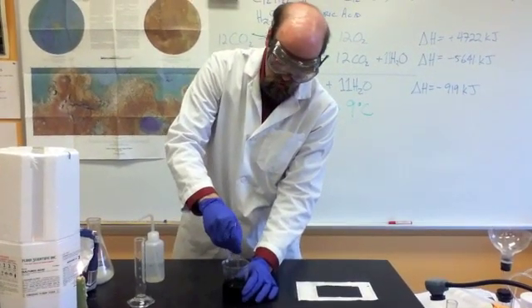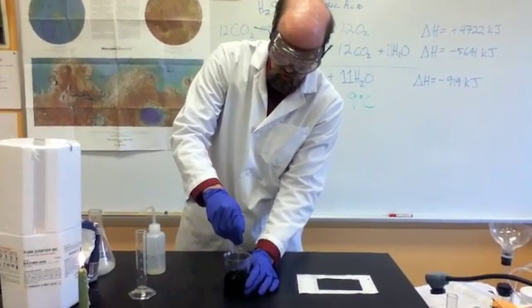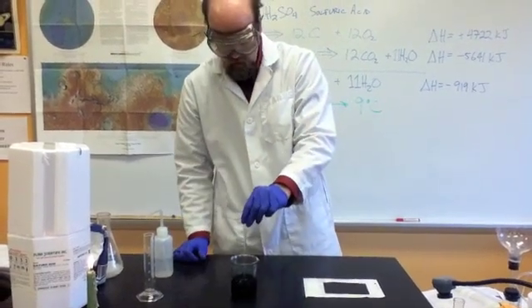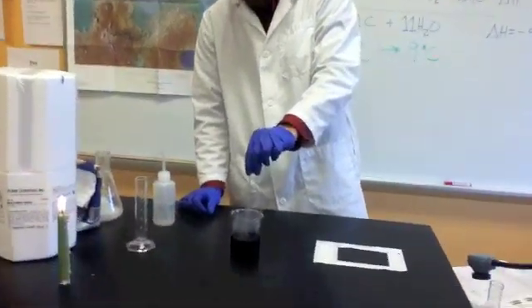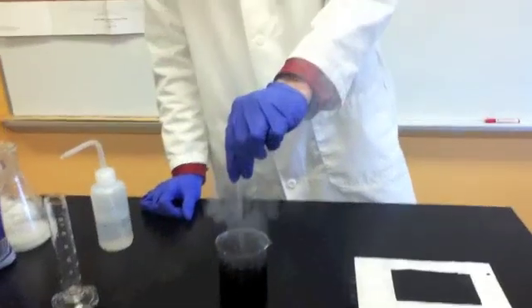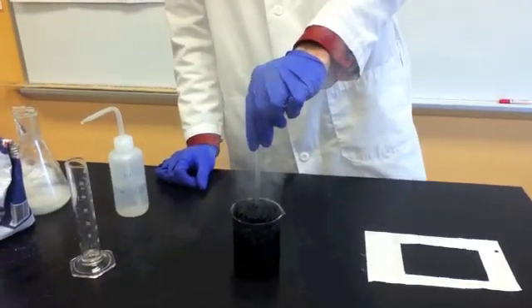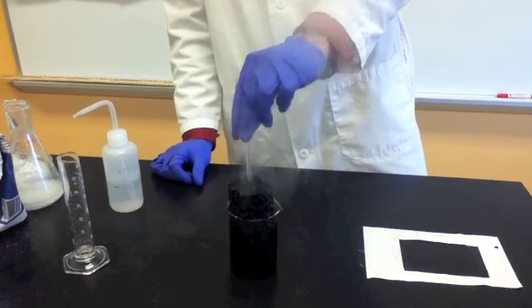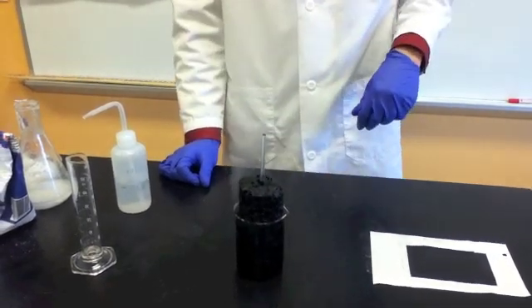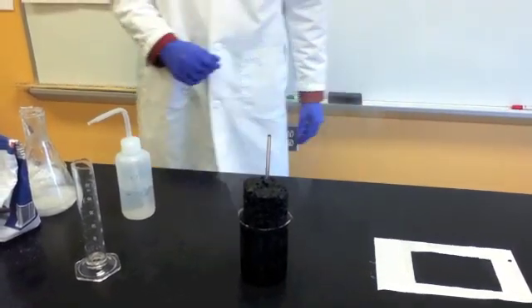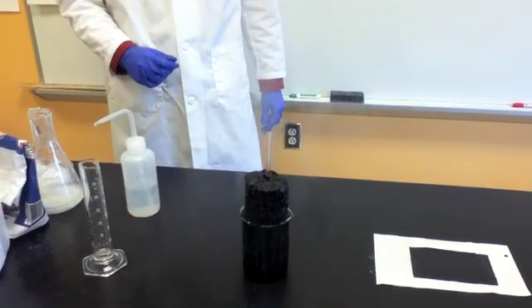Steam starts to be produced because of the interaction between the acid and the water. There we are. Now the reaction is truly underway. It has a strong odor of burnt sugar.